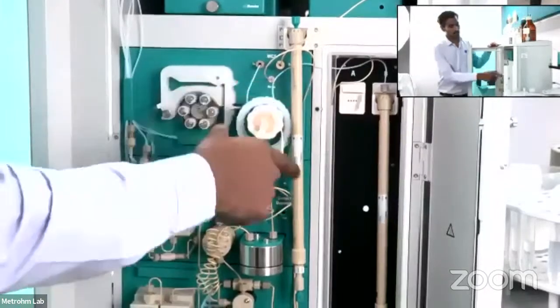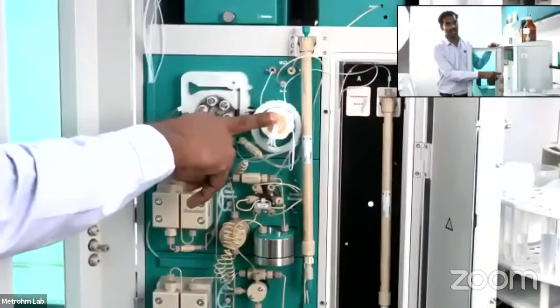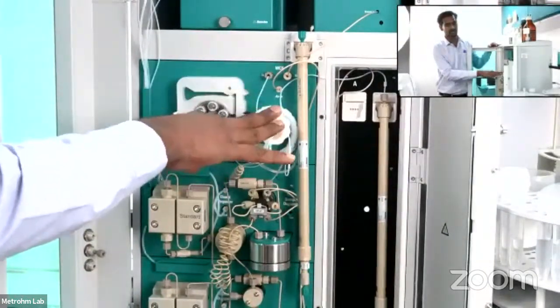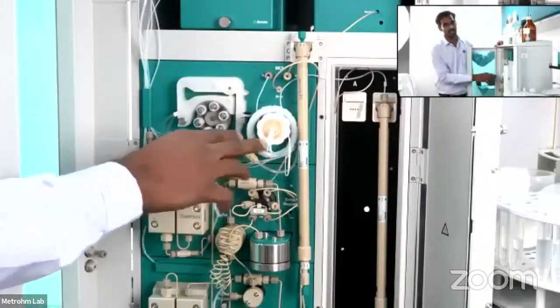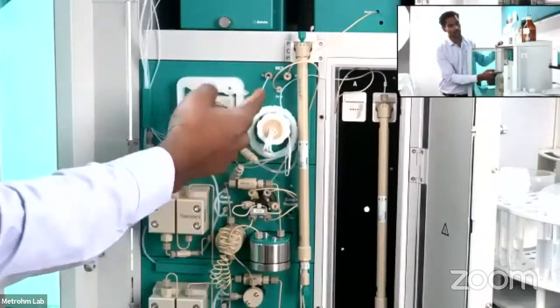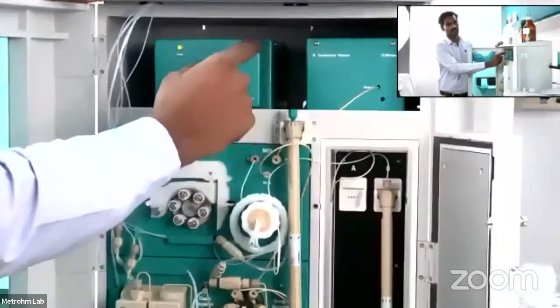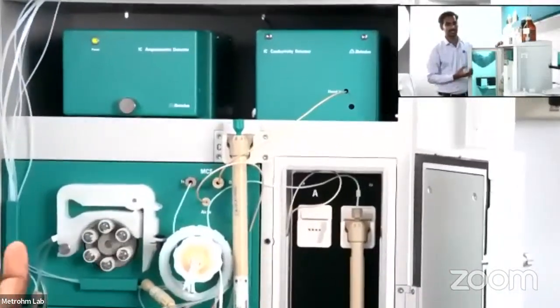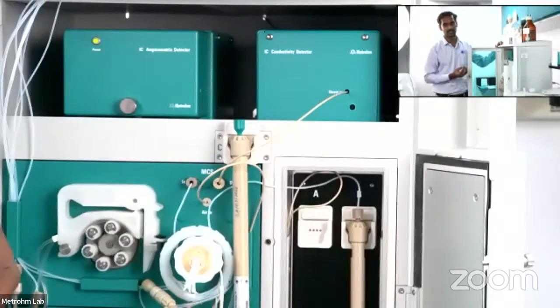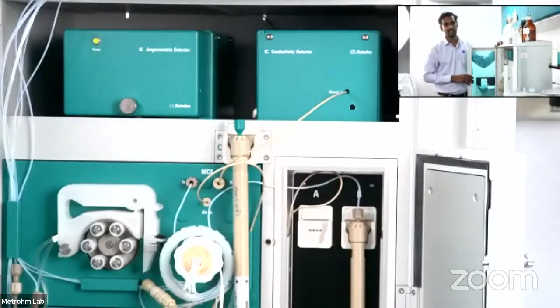Okay, so once the separation is done, it goes to the suppressor part, generally for anions. Here the suppressor reduces the mobile phase conductivity and increases the analyte sensitivity. Once it is done, it goes to the detector. So this is a conductivity detector. There the analyte is sensed, converted to data, and the data is sent to the PC, where we can get the results.